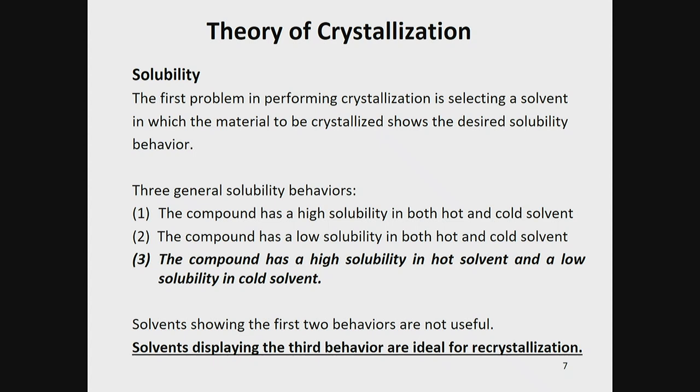What is this saying? Imagine you have hot water and cold water, and you have this unknown solid. If it's highly soluble in both hot and cold solvent, can we reclaim it from the solvent once the solvent cools down? No, we cannot, because it will dissolve when it's hot, it will dissolve when it's cold, and now we can't get the solid back.